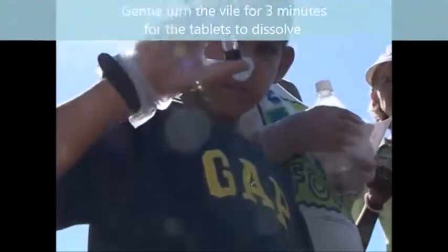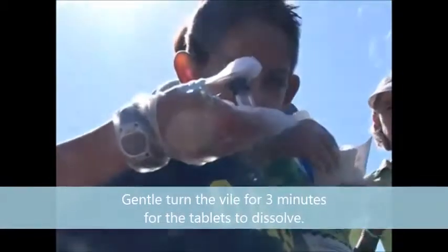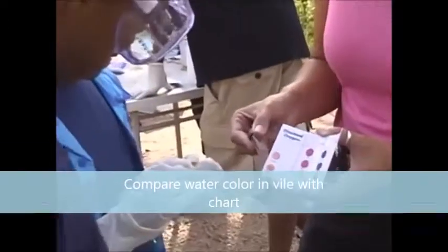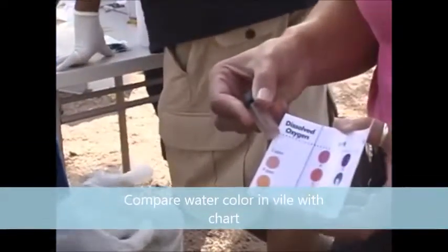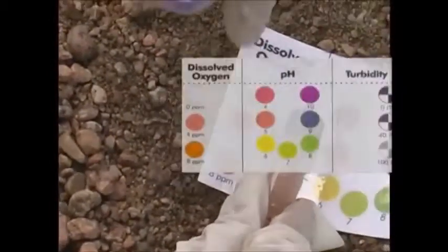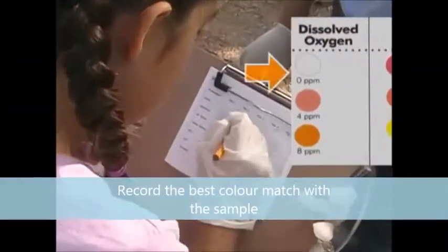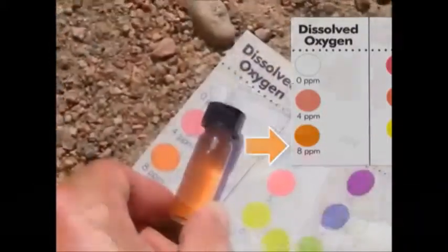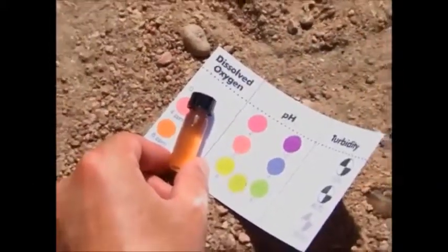Now, gently turn the vial end to end for several minutes to dissolve the tablets. Do not shake it. Once the tablets have dissolved, wait 5 minutes for the color to develop. Now compare the color of the water with the dissolved oxygen chart on the card. Select the color that most closely matches your water sample and note the value: 0, 4, or 8 ppm, or parts per million. The higher the number, the more dissolved oxygen is in the water.